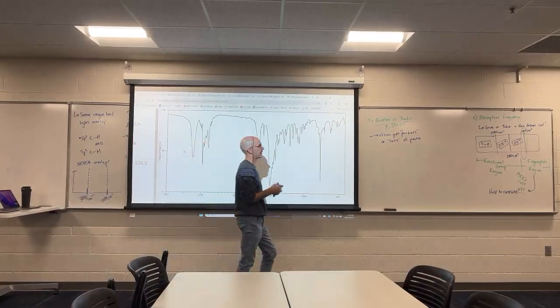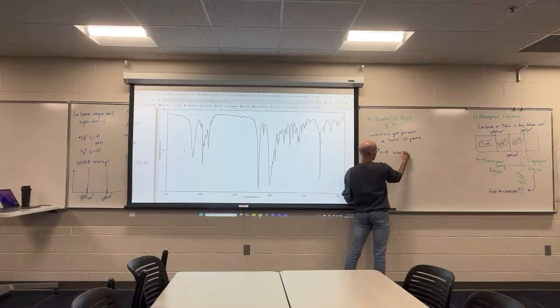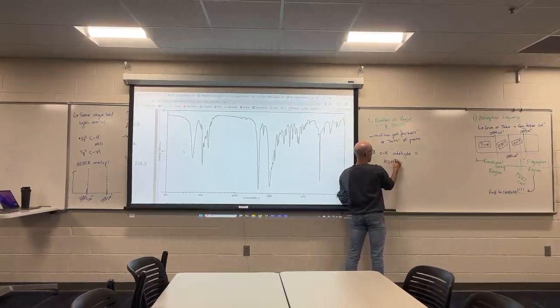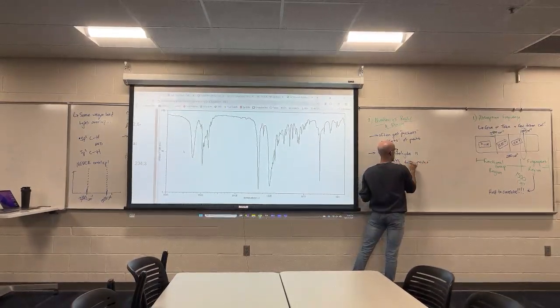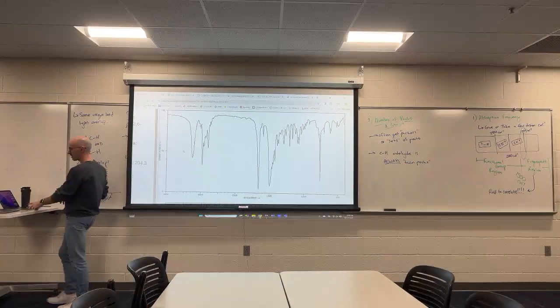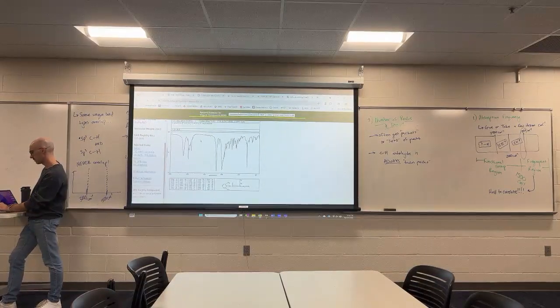There's some unique ones. I want to point out the CH of the aldehyde. The CH of the aldehyde is always this set of twin peaks.